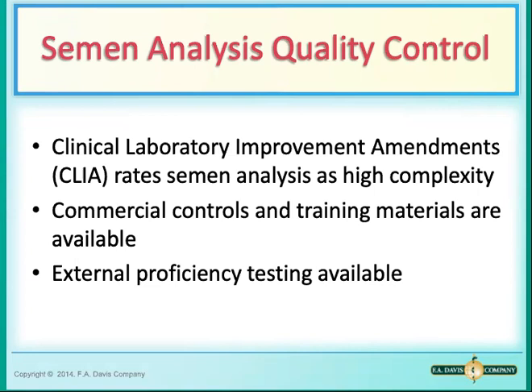But it is very important. This is actually rated as a high complexity test under the Clinical Laboratory Improvement Amendments Act, and standards for testing personnel must be observed. So it is very important that we stick to the CLIA standards when we are evaluating this, because it is considered high complexity testing. So we have to stick to the CLIA standards and the WHO recommendations when evaluating all of the aspects of sperm.